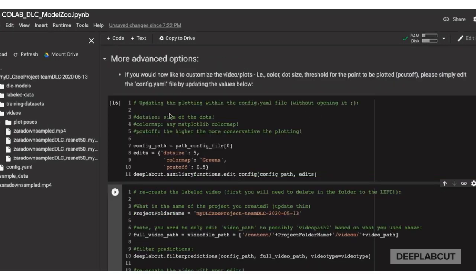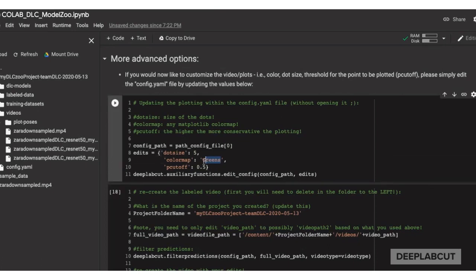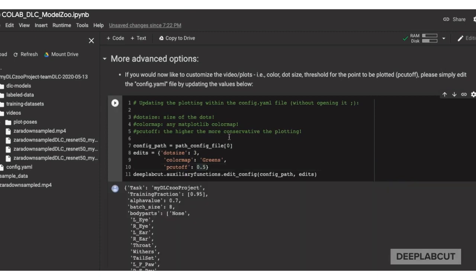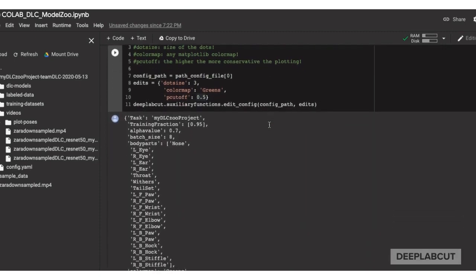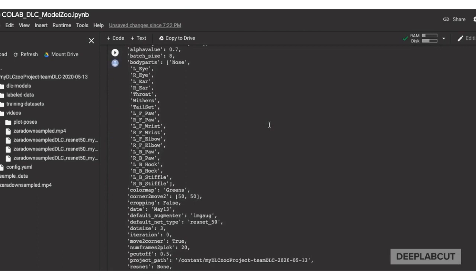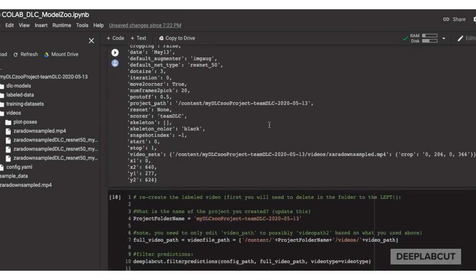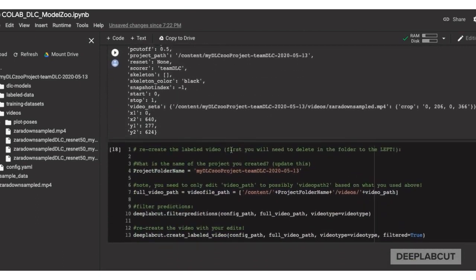Note that you can use any matplotlib color map at this point. Also, you can set the p cutoff. For those of you that might not be familiar with the software, this just tells the plotting function to only include points in the video with a threshold above 50% confidence by the deep neural network.